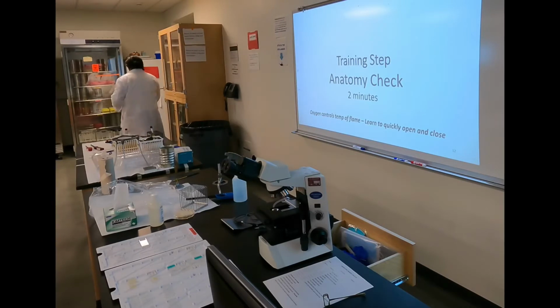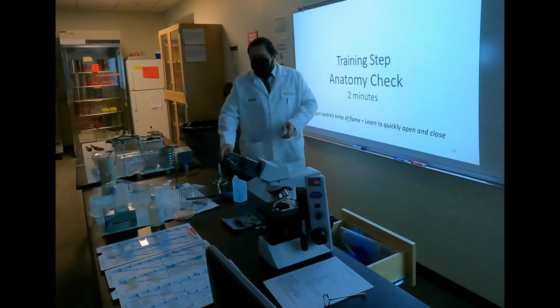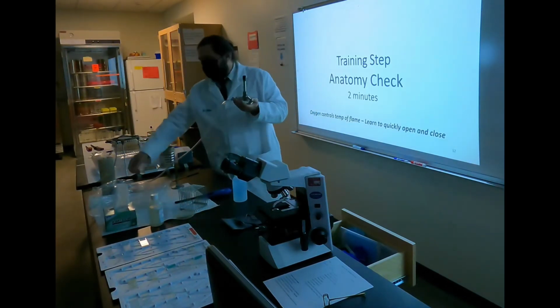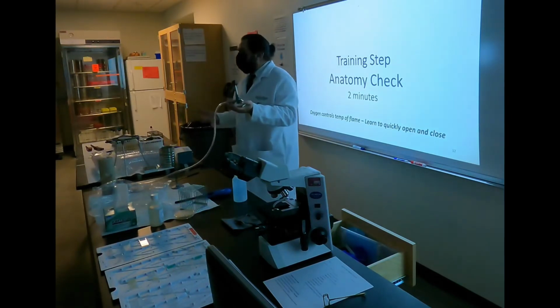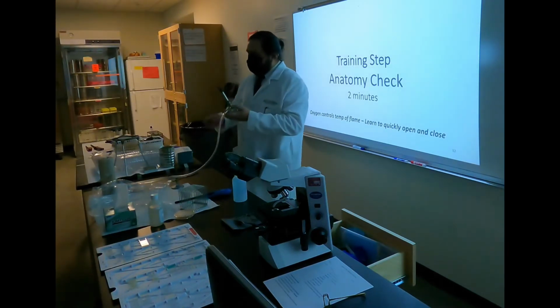The first test we're going to do is sound. You'll all be able to hear what gas sounds like. It's not anything fancy, right? So let me get this going, just for a second. You can hear it. Gas is flowing. We leave it flowing, fireball, right? So make sure that the little oxygen intake is nice and closed so we can get the coolest of the flames.